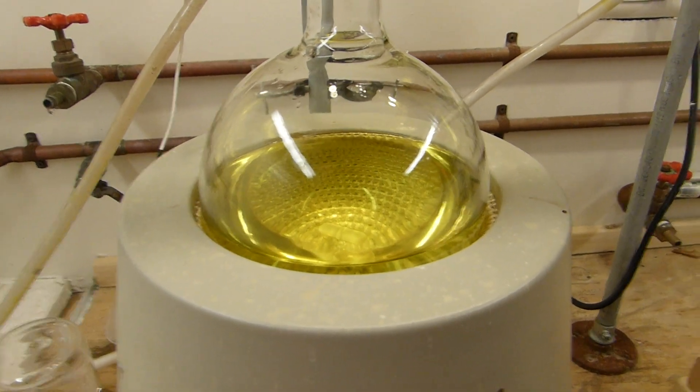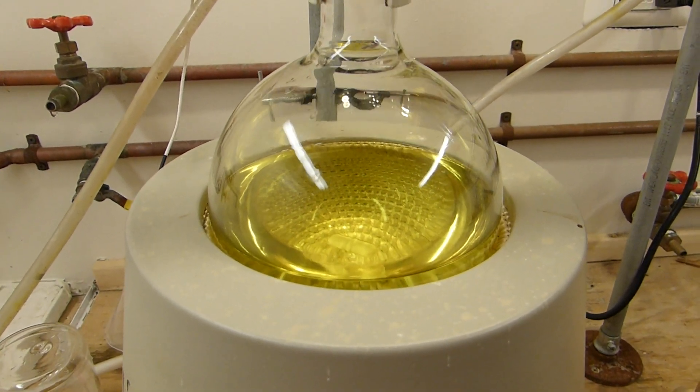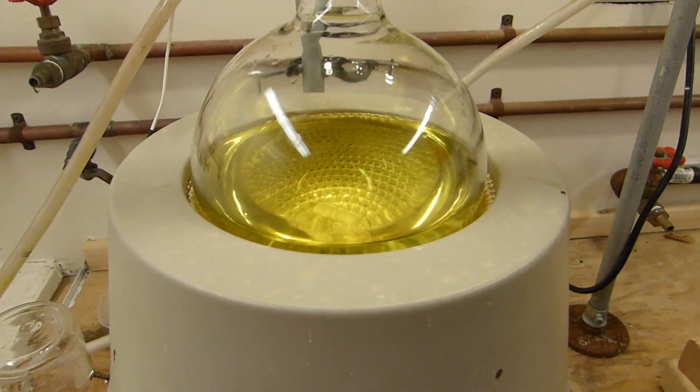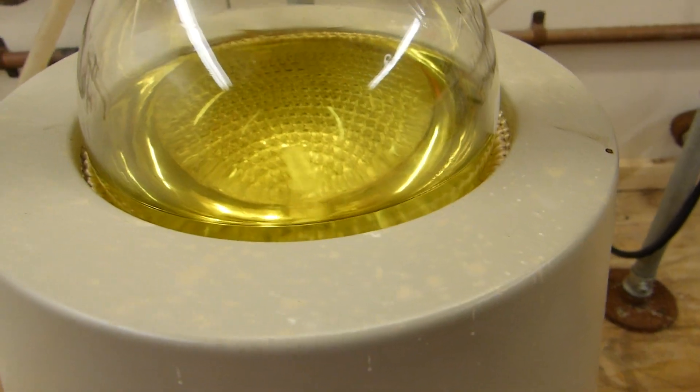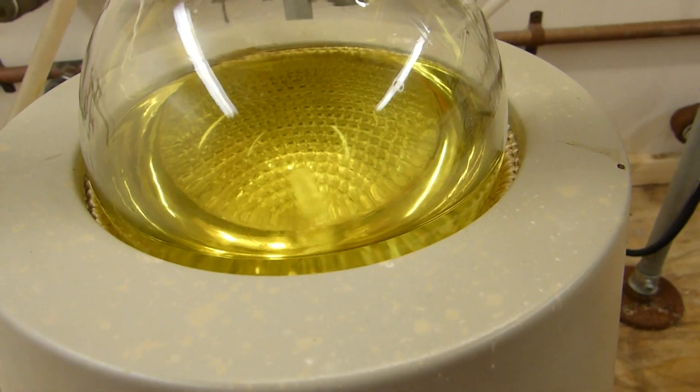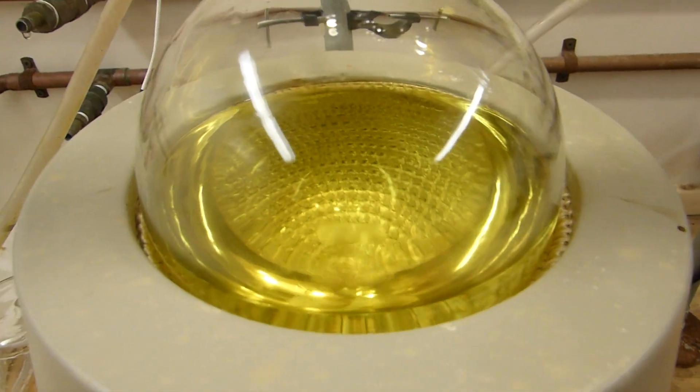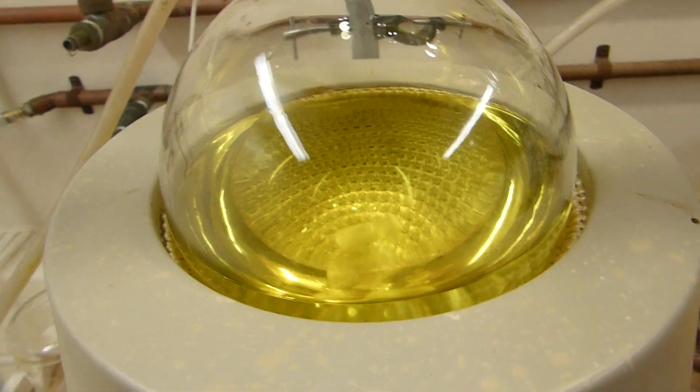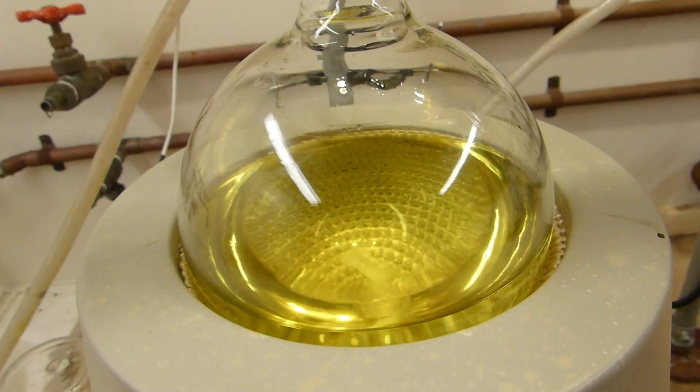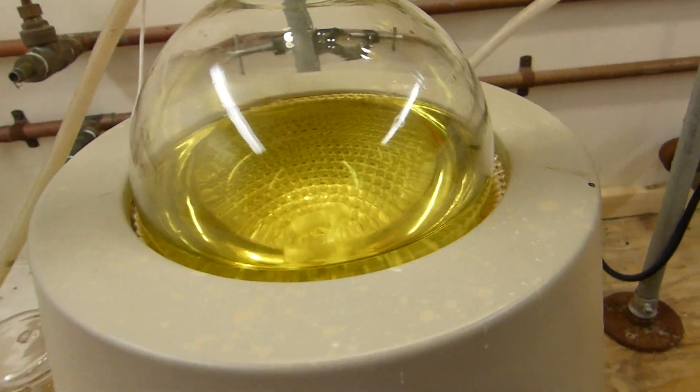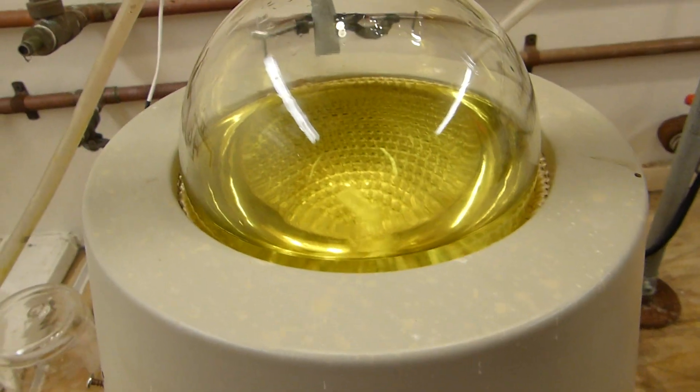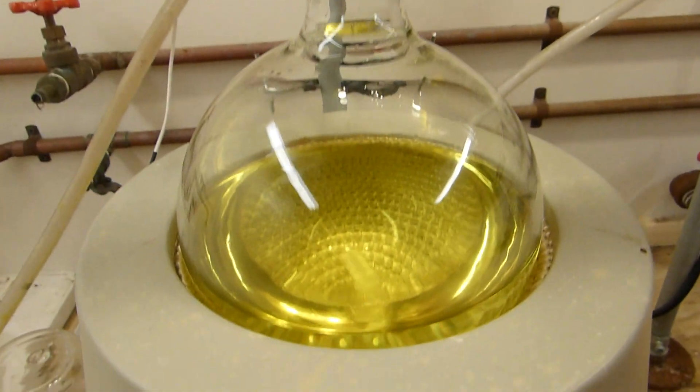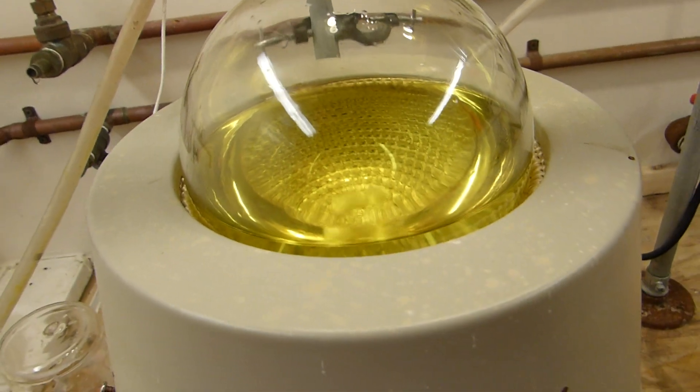There are a couple other aspects of simple distillation that you should take into consideration before you attempt it yourself. Number one is to have some method of preventing bumping. Bumping is when the liquid overheats locally, and then when a small nucleation begins, a lot of bubbles form at once and the cycle sort of repeats. So you get big foaming up frothy bubbles followed by periods of almost no bubbles. That's bad because a lot of times it'll shoot the liquid up into your condenser. Sometimes it can be so violent that it'll separate the joints of your apparatus, and of course that's not good.